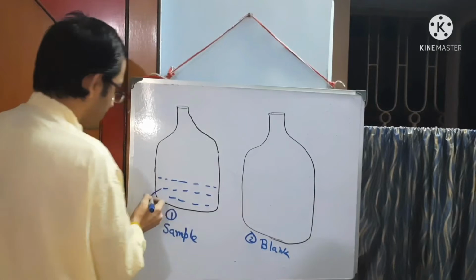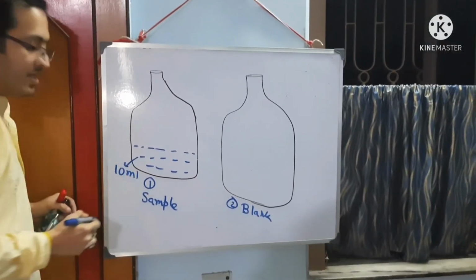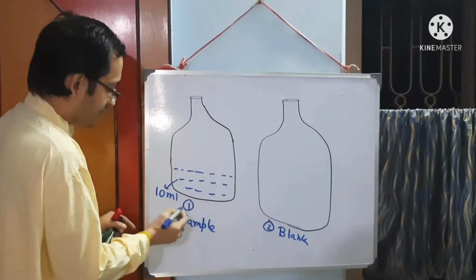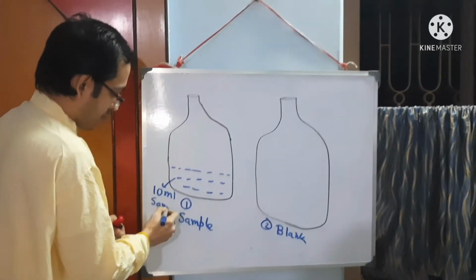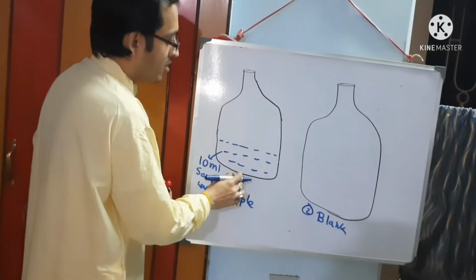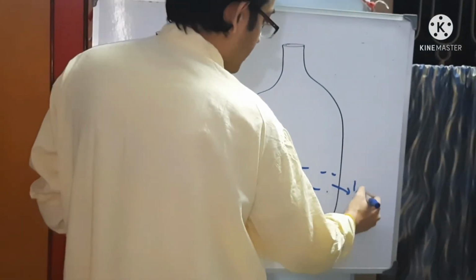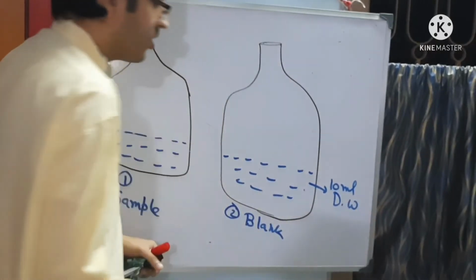Now take 10 ml of sample water in this flask, and in this flask take 10 ml of distilled water.